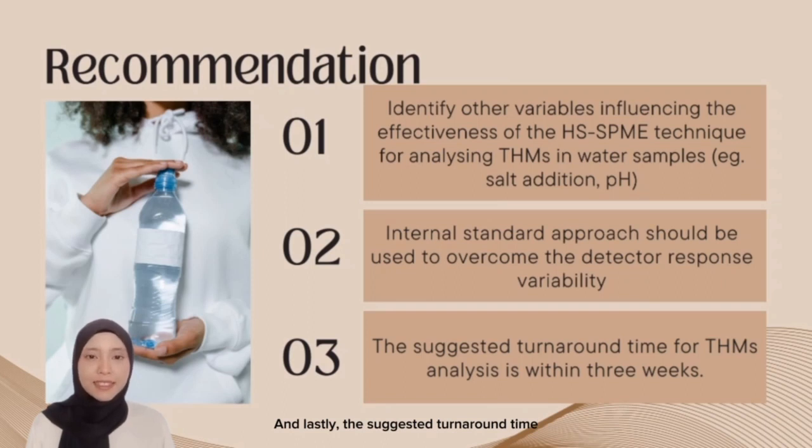And lastly, the suggested turnaround time for trihalomethanes analysis is within 3 weeks.